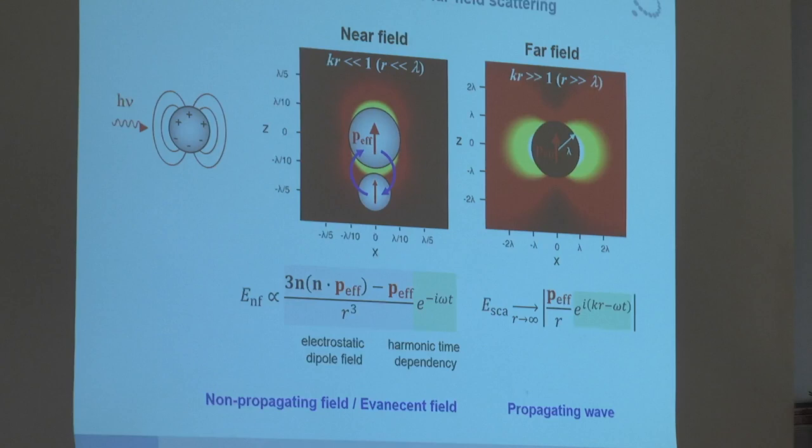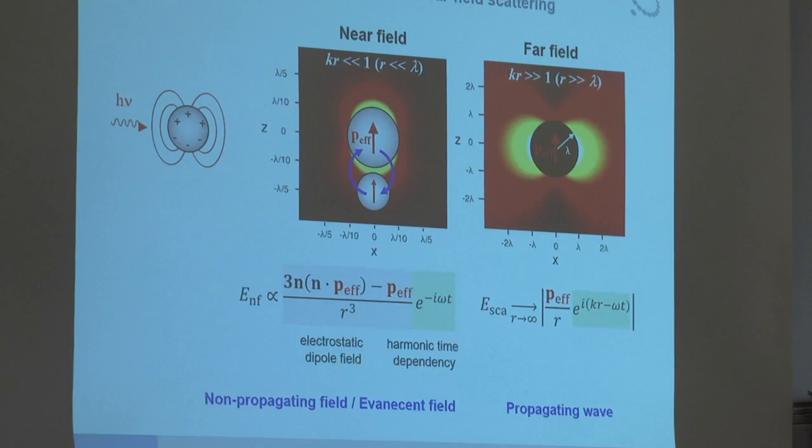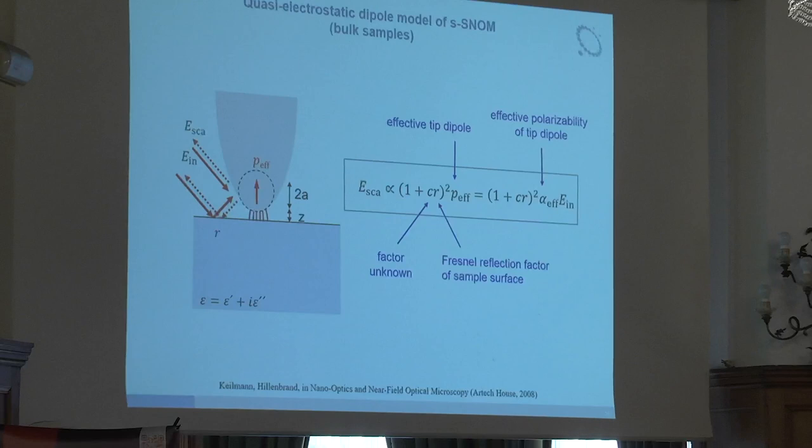While for tips, you need to do a lot of simulations, and nowadays, Isabel, one of my students, is sitting here, it still takes weeks to get a near-field spectrum calculated fully numerically if you take the whole tip into account. All right, so maybe that's a good moment to stop now.